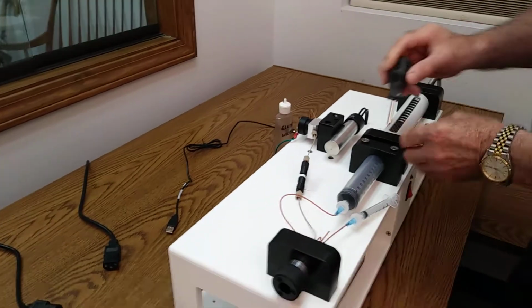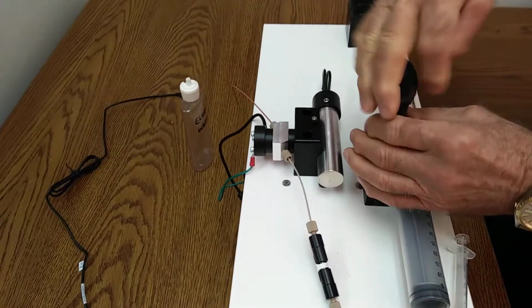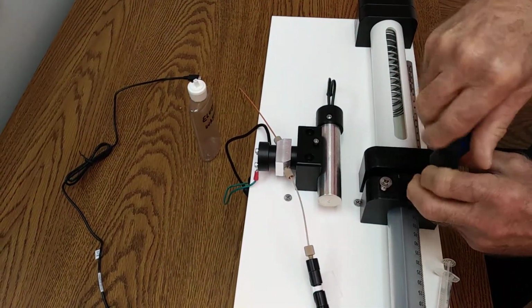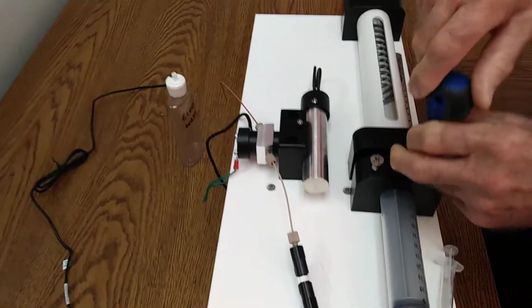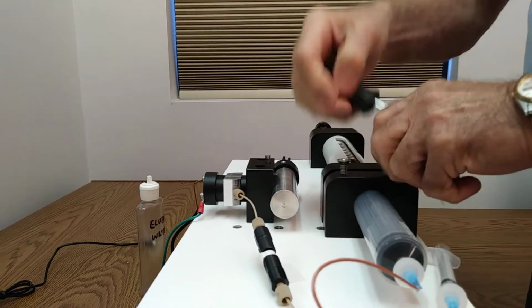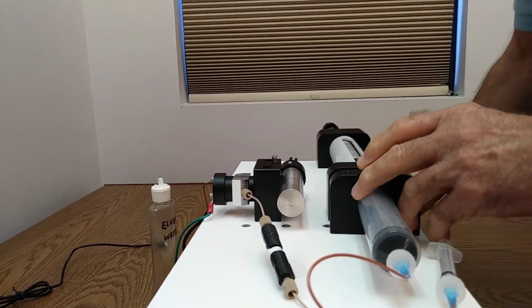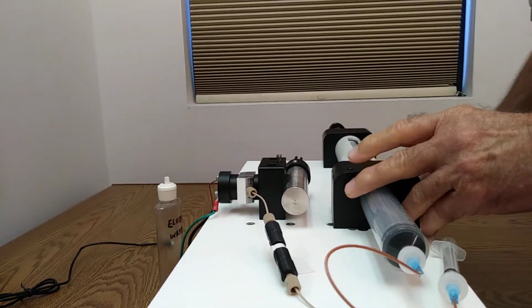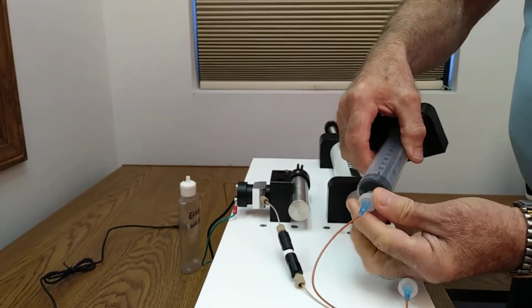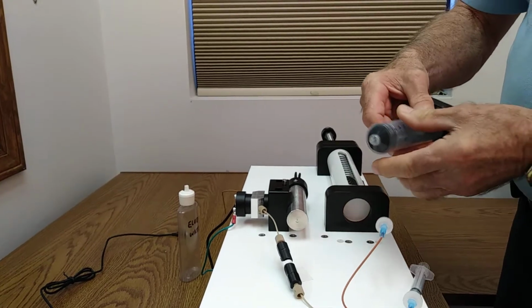So I'm going to begin by removing the syringe holding block from the top of the instrument. We're going to fill the syringe with eluent. Eluent is the fancy name for the stuff that flows through the column. I don't know where the name came from, but that's what it's called in the industry. So we're going to remove this from here. I'm going to hold this little filter in my fingers and gently twist to the left and unscrew the syringe.